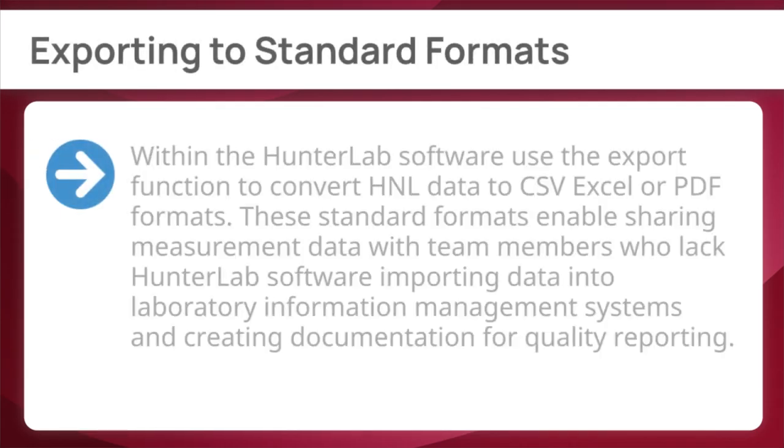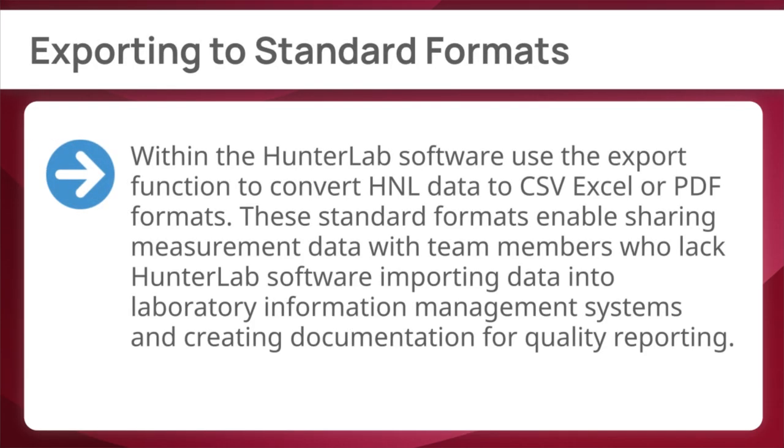Next, exporting to standard formats. Within the HunterLab software, use the export function to convert HNL data to CSV, Excel, or PDF formats. These standard formats enable sharing measurement data with team members who lack HunterLab software, importing data into laboratory information management systems, and creating documentation for quality reporting.